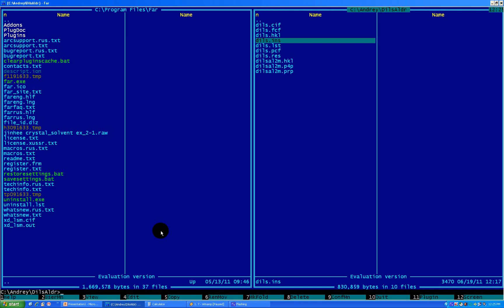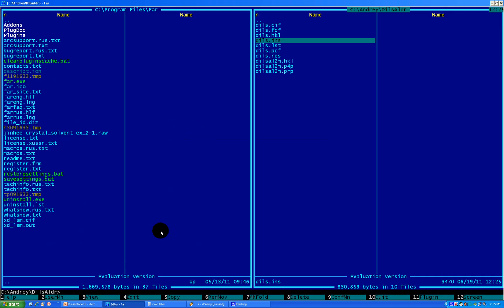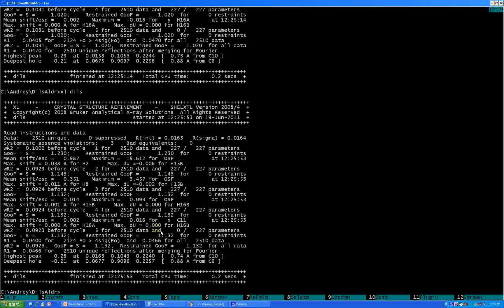In this case, you go back to your INS file and correct the 0.05 to 0.03. Then run SHELX again. If you look now, it's again further decreased our R-factor. It's definitely made our R-w2 below 10%, which is quite nice. I like it below 10.